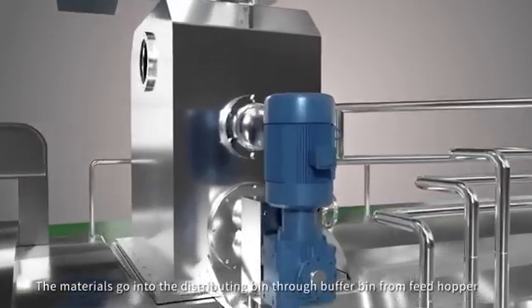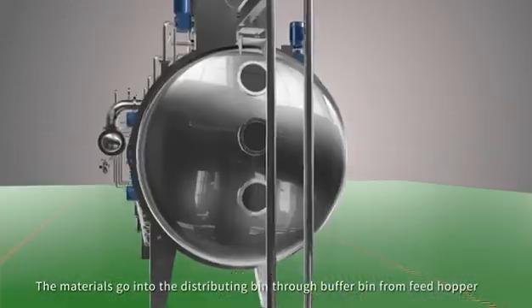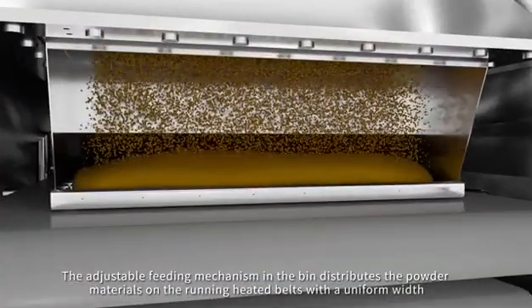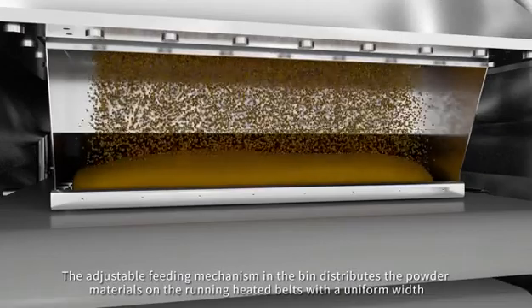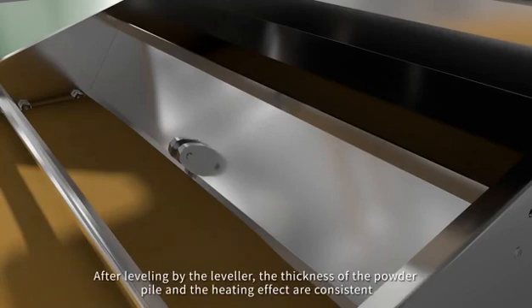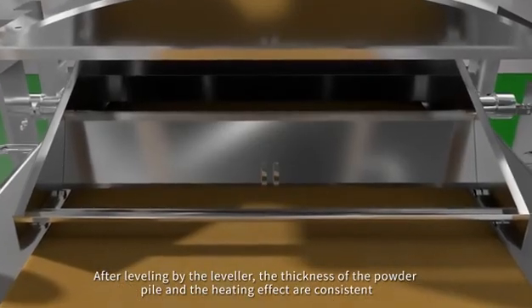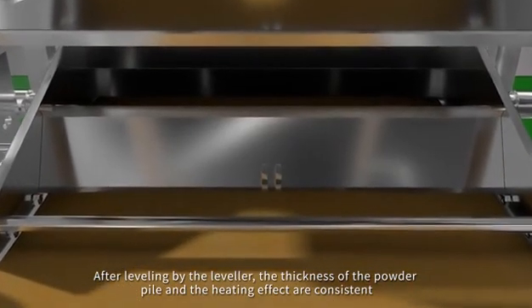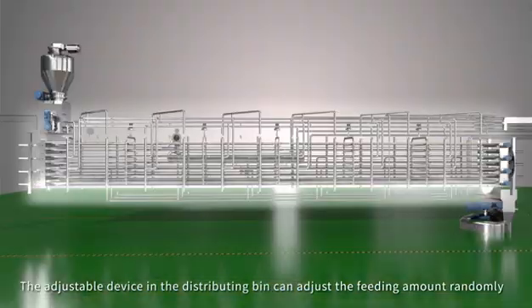The materials go into the distributing bin through buffer bin from feed hopper. The adjustable feeding mechanism distributes the powder materials on the running heated belts with uniform width. After leveling by the leveler, the thickness of the powder pile and the heating effect are consistent. The adjustable device in the distributing bin can adjust the feeding amount.